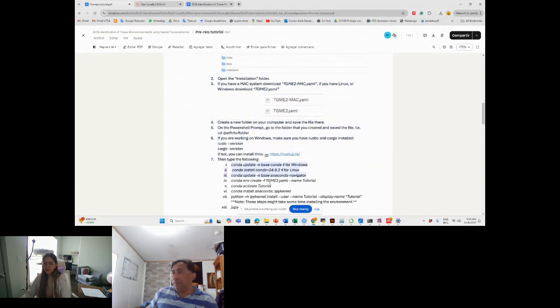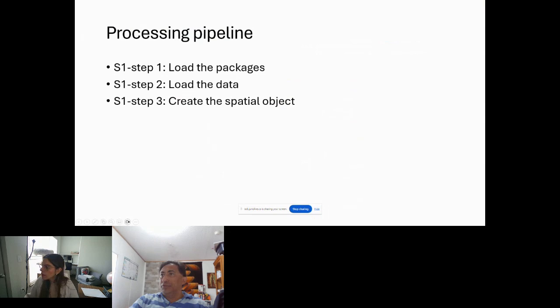with these 3 lines, depending on what you have. I think this one also works for Windows, but this one won't work for Linux. Okay. In case you have that problem, you can do this. For now, Carla already got the conda environment working, so why don't you work on that one?